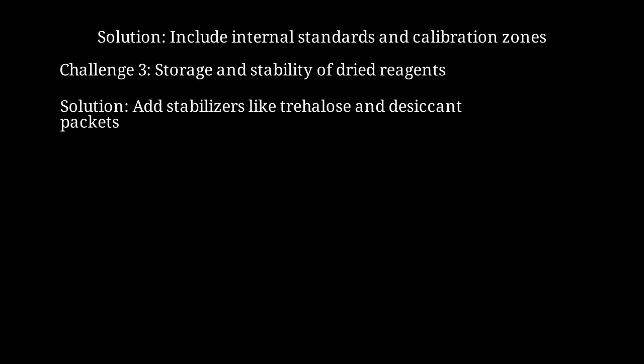Challenge 3. Reagent stability. Enzymes and antibodies can degrade when stored dried in paper, especially in hot climates. Solution. Add chemical stabilizers like trehalose, a sugar that protects proteins during drying. Package devices with desiccant packets and in foil pouches for extended shelf life.